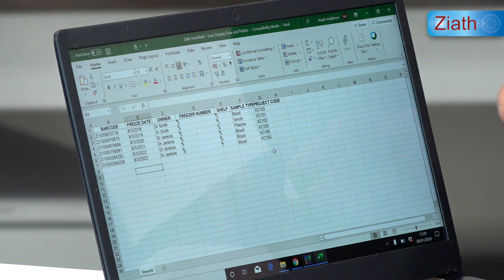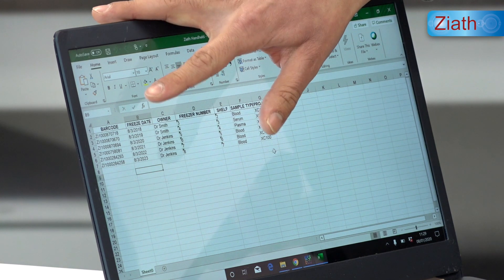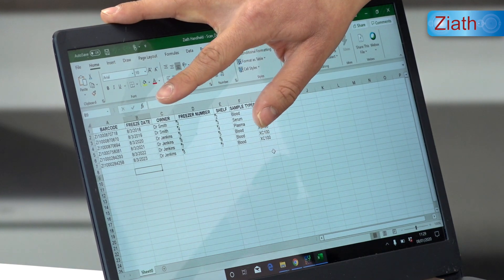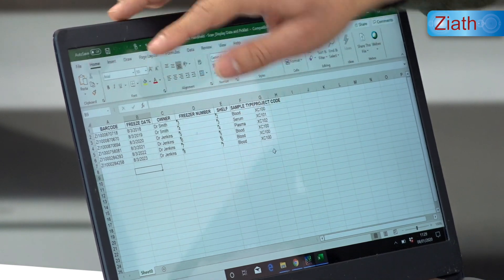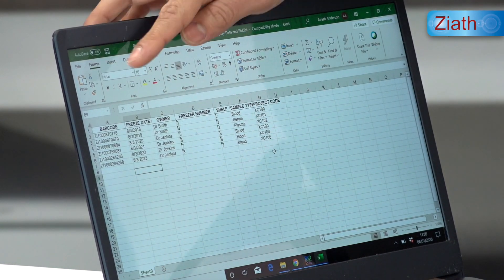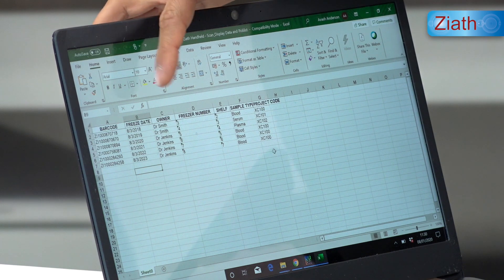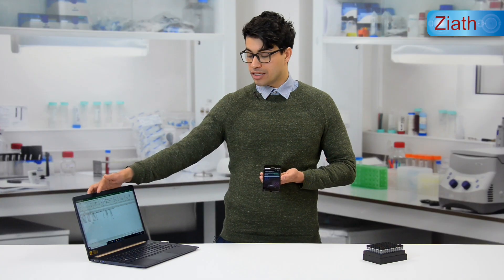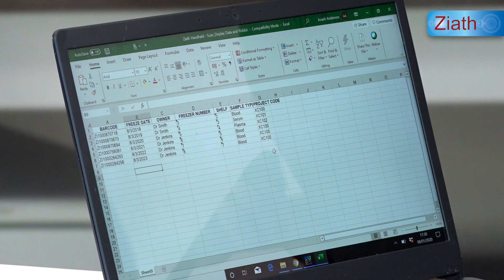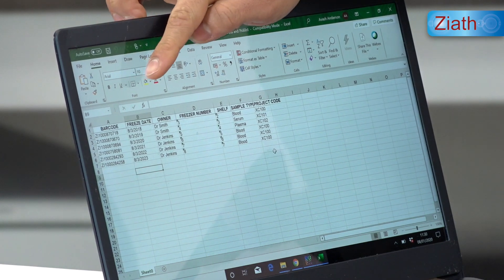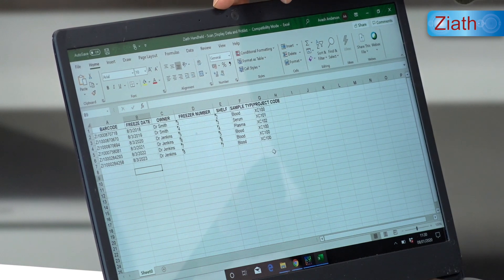This is the Excel file that I have placed onto the handheld device. You can see that the barcode is in column A — that is important and the barcode must always be placed in the first column, column A. There are some other columns which are all completely customizable and editable. Whatever is shown in the column headers in the Excel file will be displayed on the handheld.